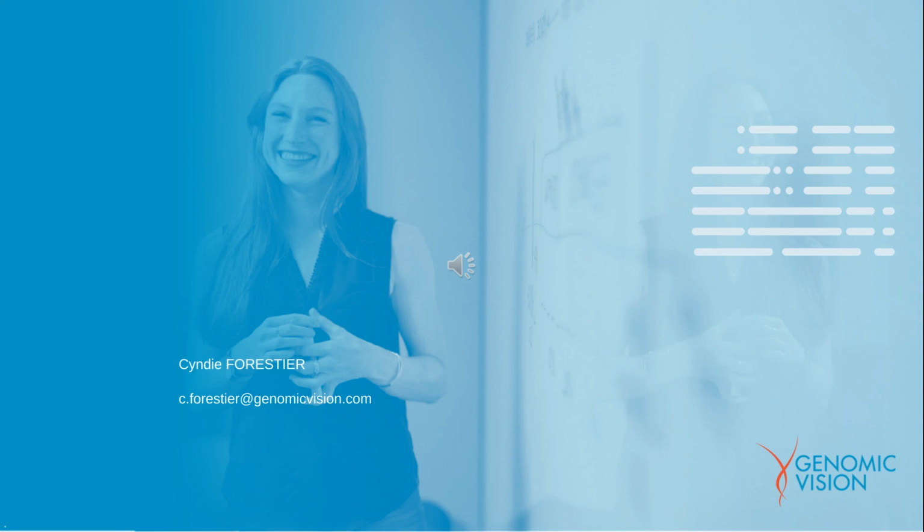And our last question is, which brands of antibody do you use for CldU and IdU? We found none that are truly specific since the original brand was discontinued in 2017. Yeah, so since a few years now, we use other brands to replace the brand that has been discontinued. For the CldU, we use Abcam, and for the IdU, we use BD Biosciences as a brand for the antibody.